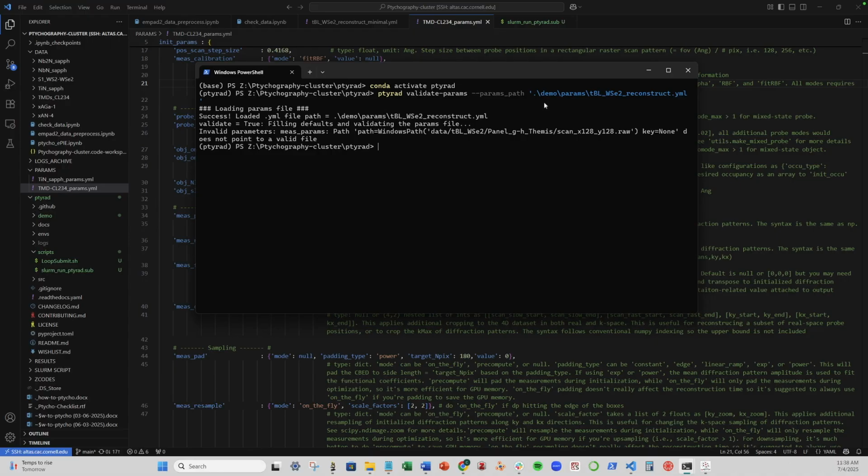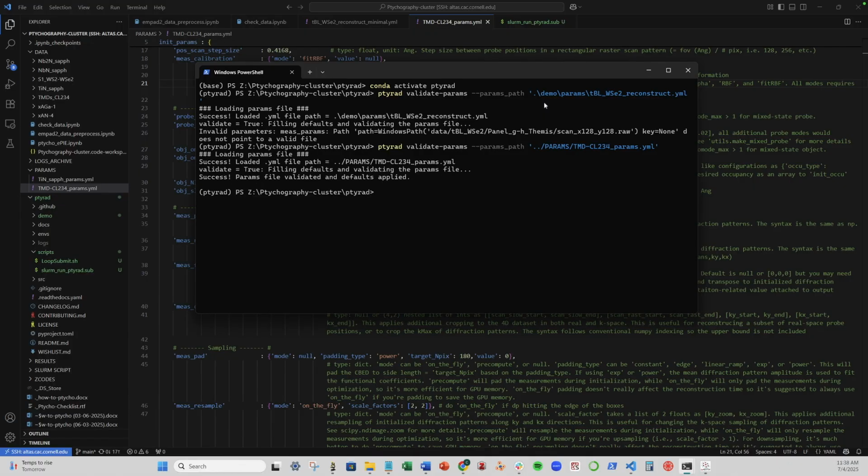But for example, if I do the same thing with the data that is actually here, params that I was running beforehand, params.yml. Success. It validated and everything is good to go.